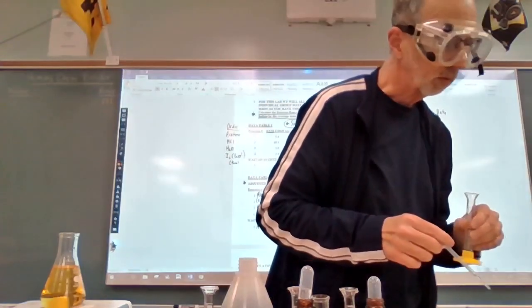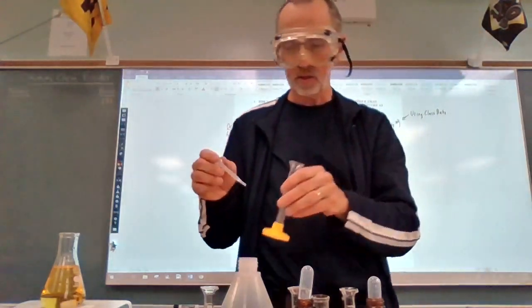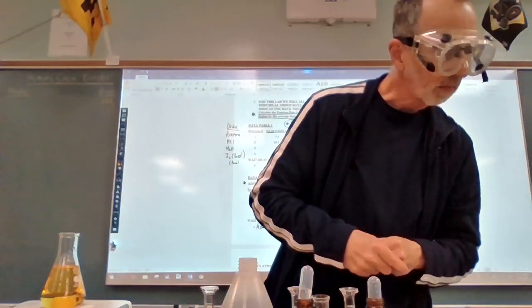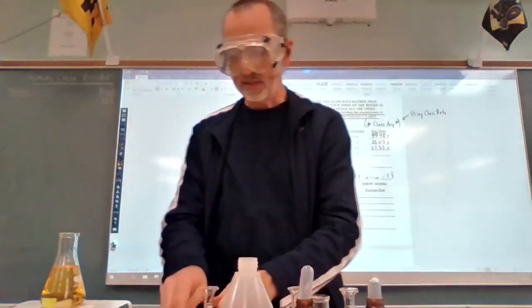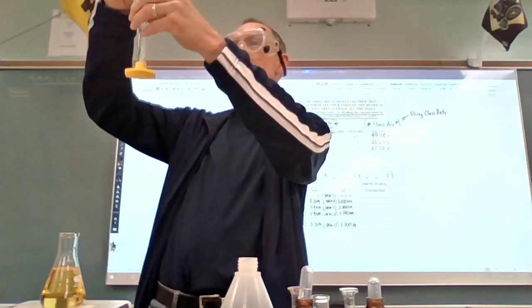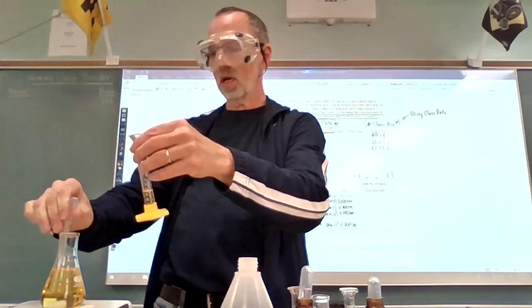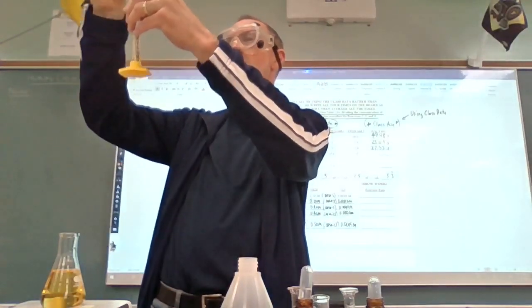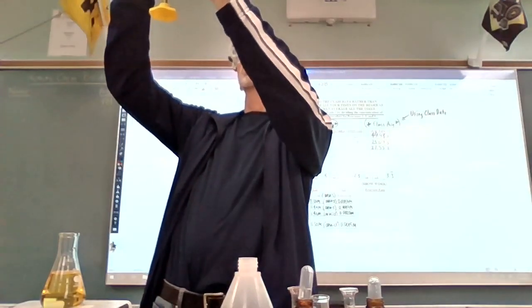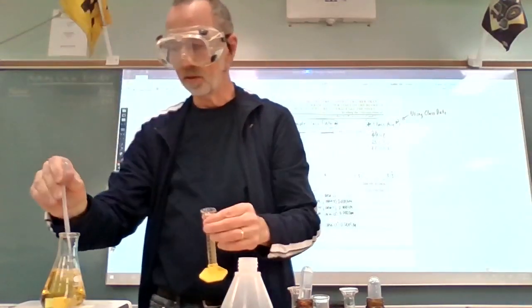Oh, water is 0. Sorry, no water this time. And iodine is 10 this time.